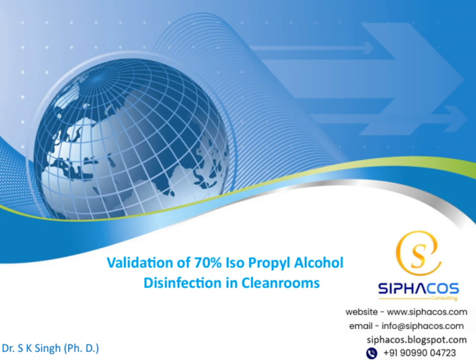Today, we will be exploring the validation of 70% isopropyl alcohol disinfection in cleanrooms. This presentation, led by Dr. S.K. Singh, Ph.D., will cover the key aspects of disinfectant effectiveness and validation processes. We'll look at the methodology, results, and implications for maintaining sterile environments. So, without further ado, let's dive into the topic and see how this important disinfection process is validated and optimized.